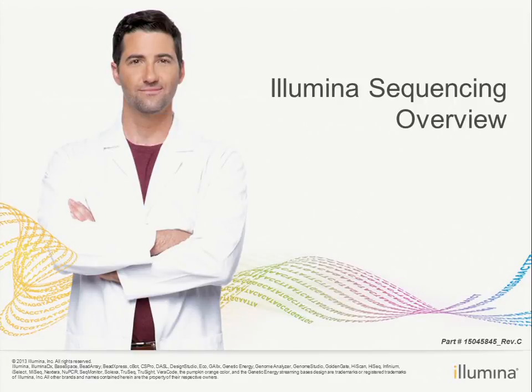So please interrupt me anytime you have any questions. We just want to make the training a little bit casual. So the first part will be about the Illumina sequencing overview.